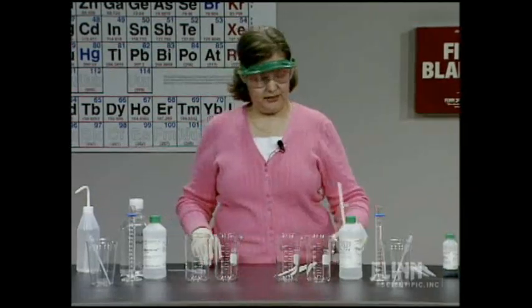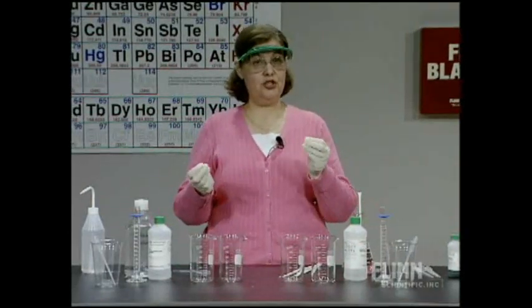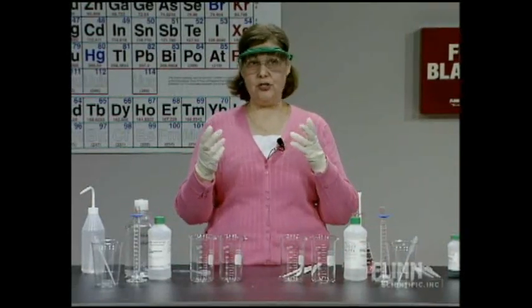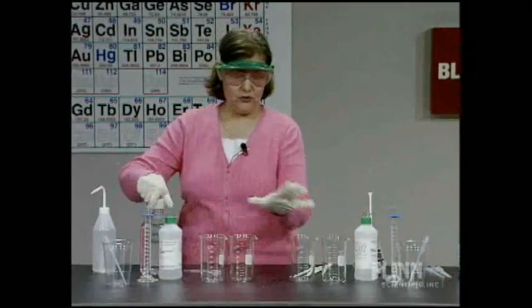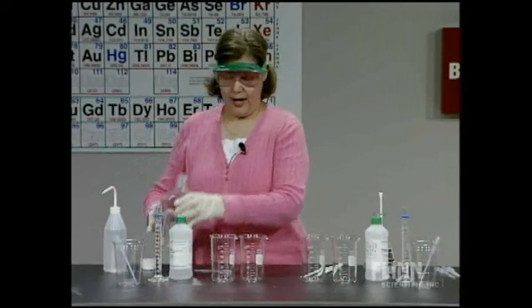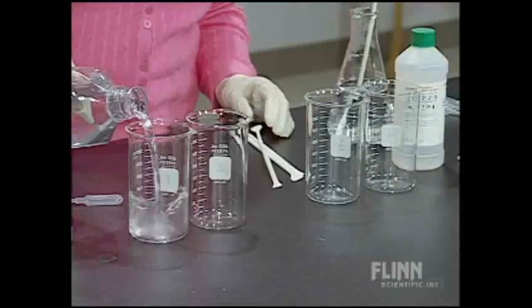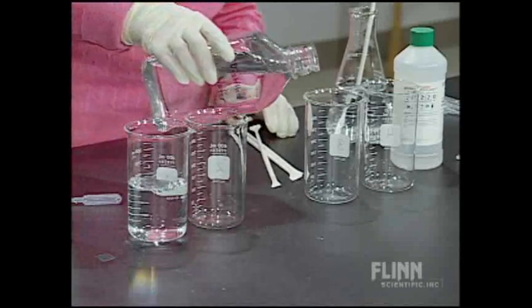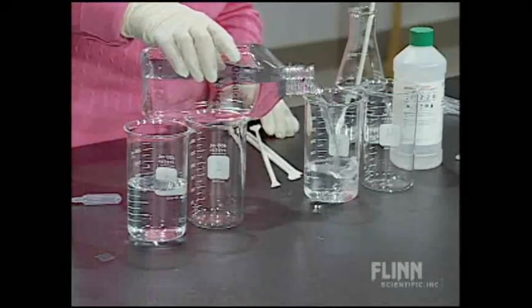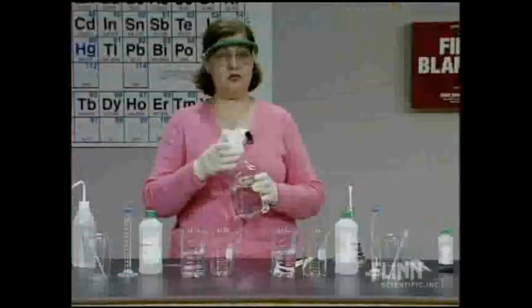The definition of a buffer is that it can withstand the addition of small amounts of excess strong acid or strong base without changing the pH. What we're going to do is put distilled water in beakers one and three — about 200 milliliters — and use 200 milliliters of my buffer in the other beakers. First, I'm going to look at the effect of adding strong acid, then the effect of adding strong base.